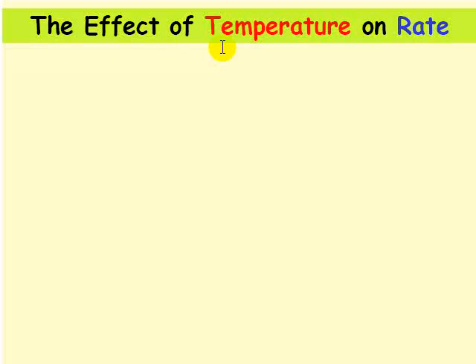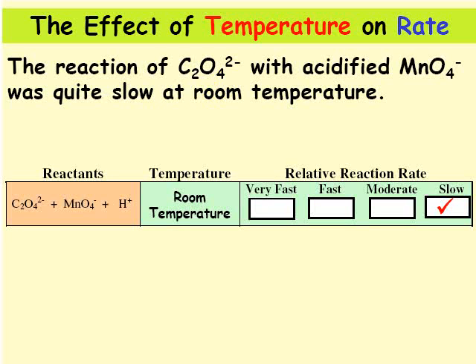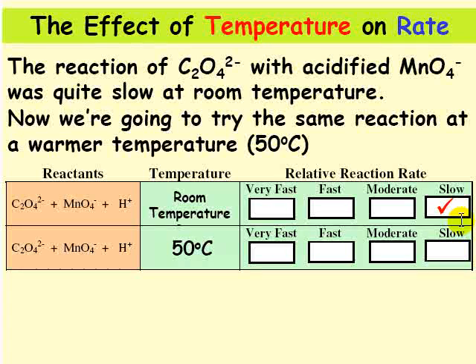Now we're going to have a look at the effect of temperature on reaction rate. The reaction of acidified MnO4- with oxalate ion was quite slow at room temperature as you saw. This time we're going to repeat the reaction except we're going to use a 50 degree solution. It's been in a 50 degree water bath.